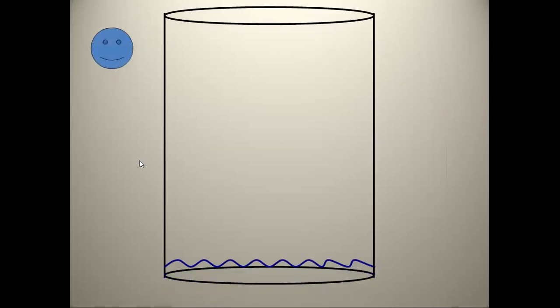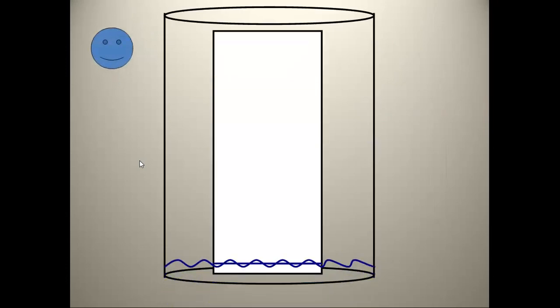Okay, so you have the solvent like paper chromatography. So make sure that the spot does not touch the solvent. So when you allow the solvent to rise, nangyari dito? Sana nag-rise siya.